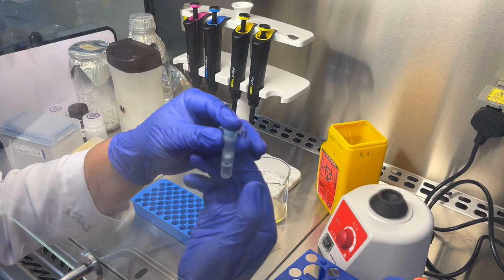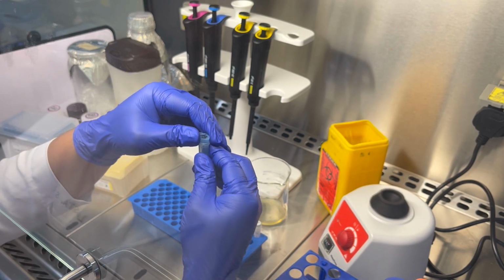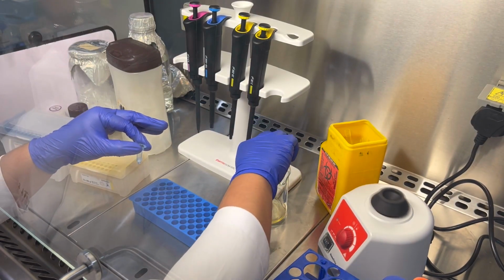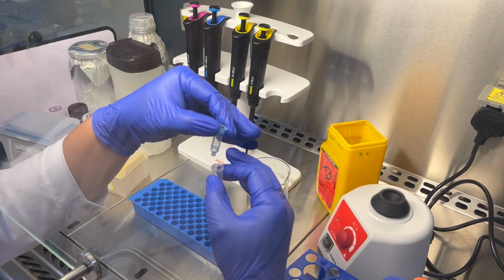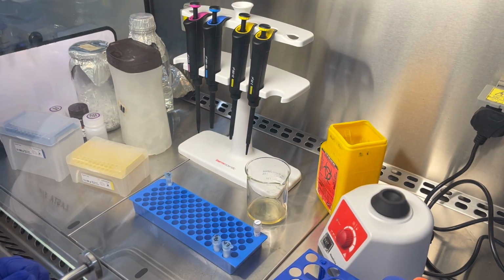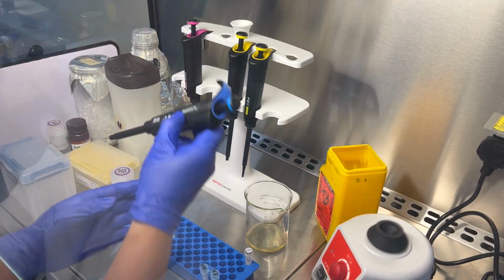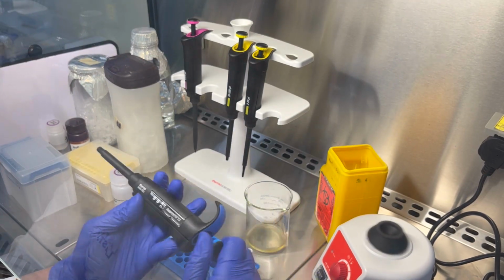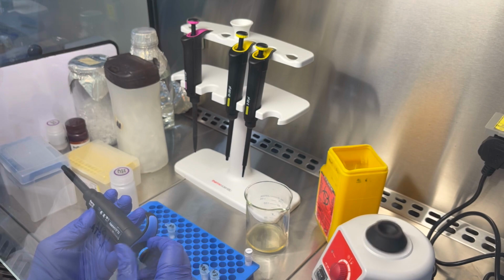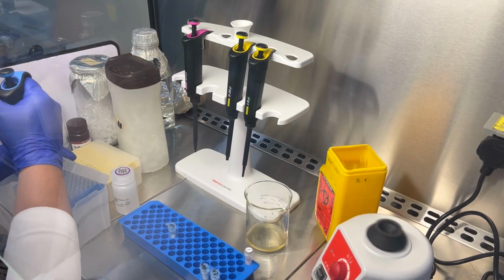In discarding it, gently detach the spin column from the collection tube. Make sure that you do not touch the silica membrane. After discarding the flow through, you gently reinsert the spin column onto the collection tube. We then proceed with washing. We use a wash buffer, which is provided by the extraction kit. We add 650 UL of the buffer onto the reassembled spin column.